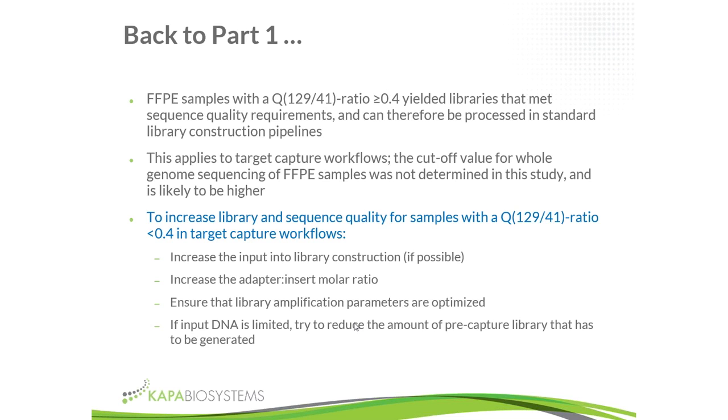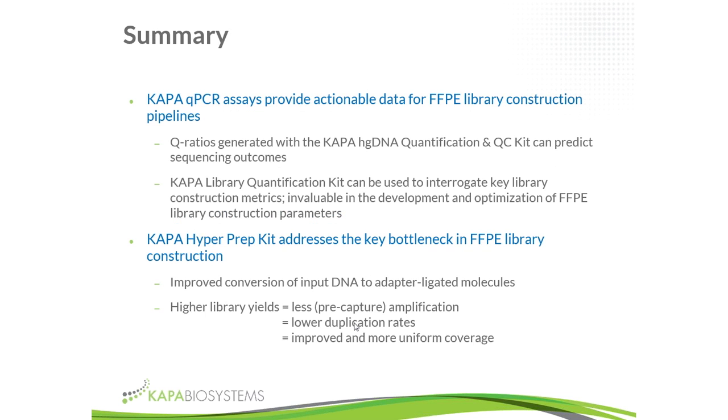So don't aim to make a microgram if you don't need one. Aim to make 200 or 300 nanograms, which still gives you enough for your downstream process and also for QC. And do things like, for instance, if you need to look at your library on a bioanalyzer or other electrophoretic device, use the highest sensitivity device you can so that the QC requirement does not add to the requirement of library that needs to be generated.